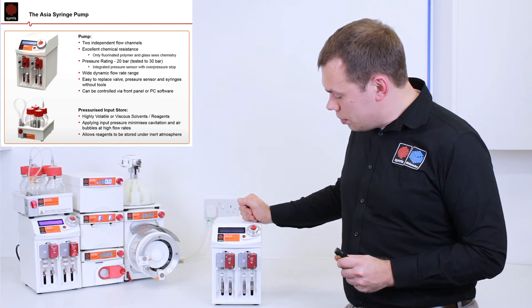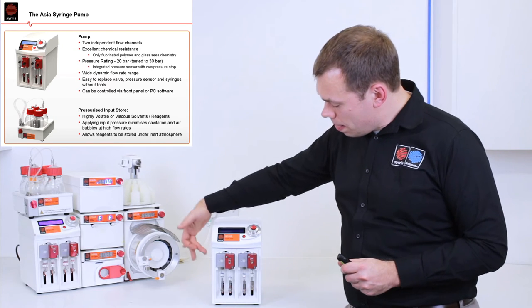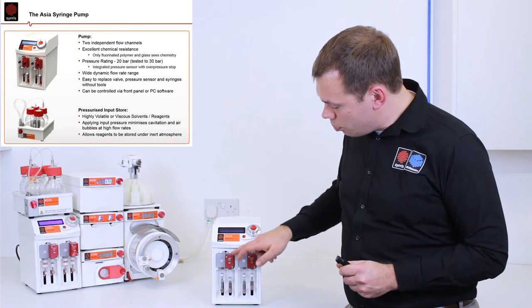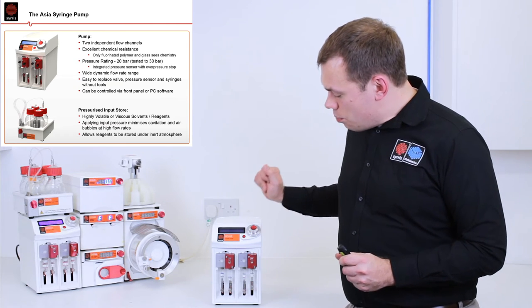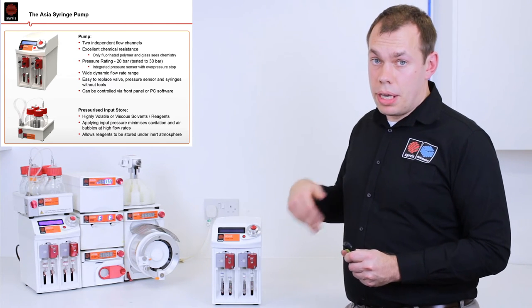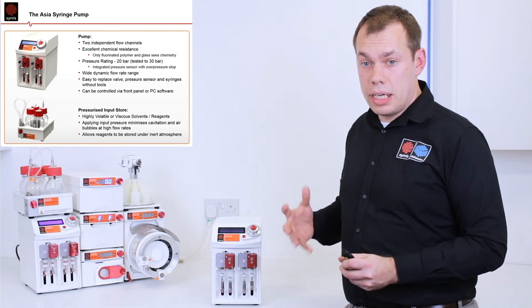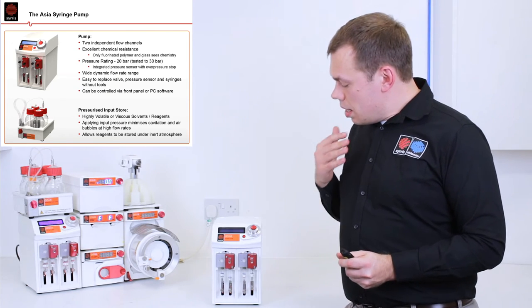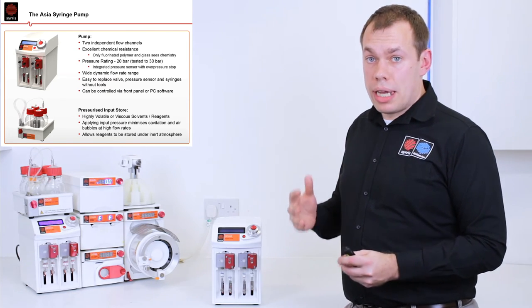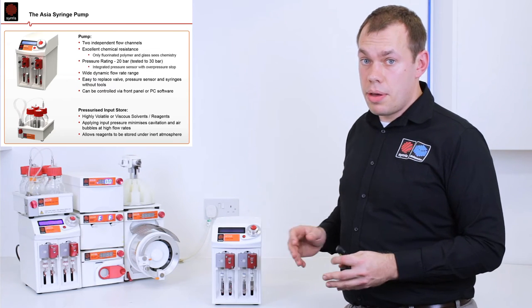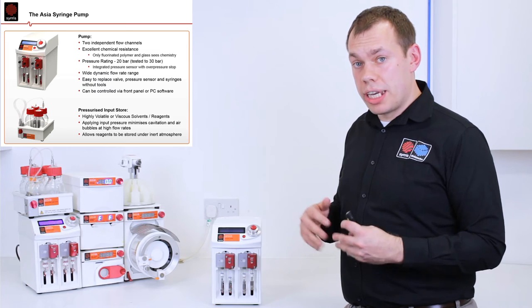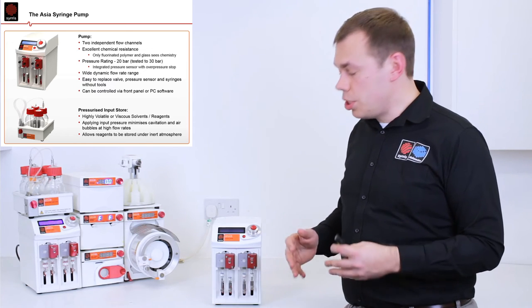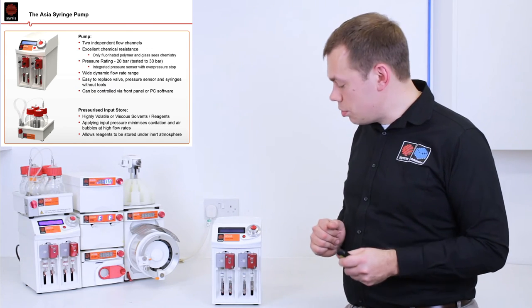Each of those channels is made of three parts. The valve, the pressure sensor and the syringes. Pressure sensors are very important because they enable safety on your pump. The pump has an automatic shutdown built in when abnormal pressure is detected. And also when pressure cannot be achieved, which is usually a sign of leakage, the pump will stop automatically.